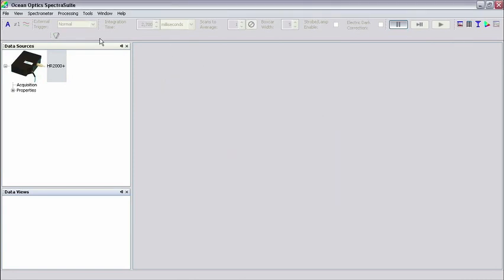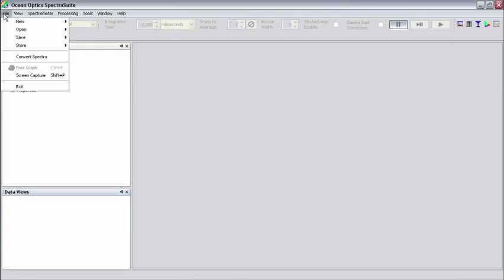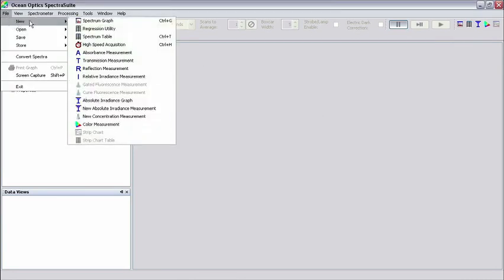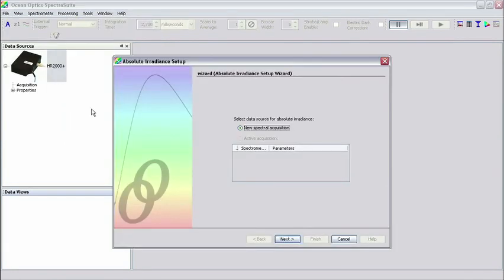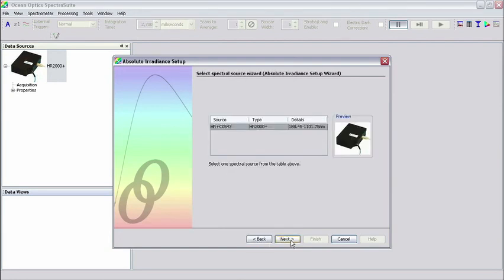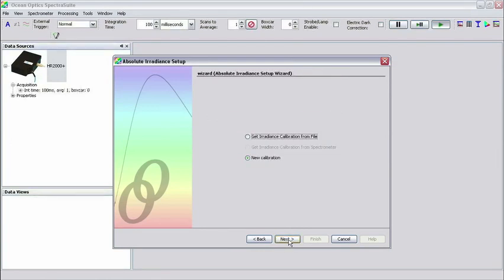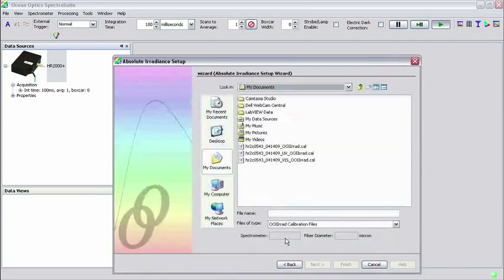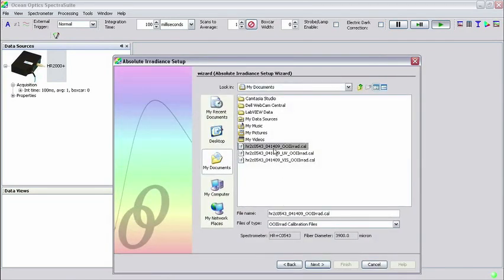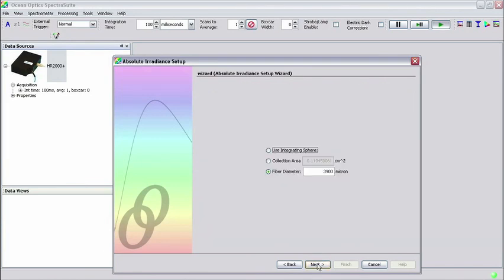Now click File, then New, then Absolute Irradiance Measurement. Select New Spectral Acquisition and click Next. Make sure that your spectrometer is highlighted. Once you've done this, click Next. Select Get Irradiance Calibration from File and click Next. Now select the combined calibration file that we saved before and click Next again.